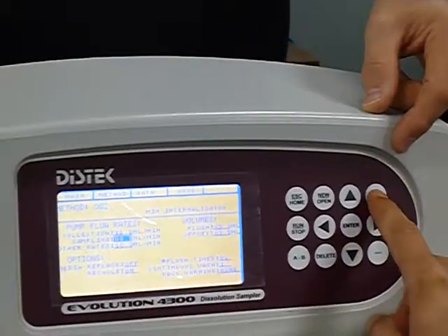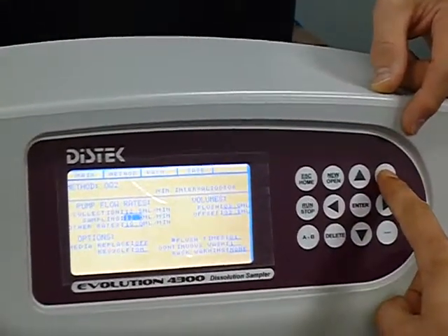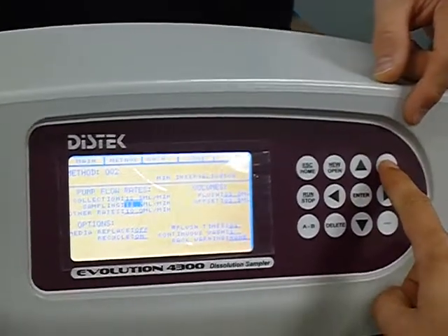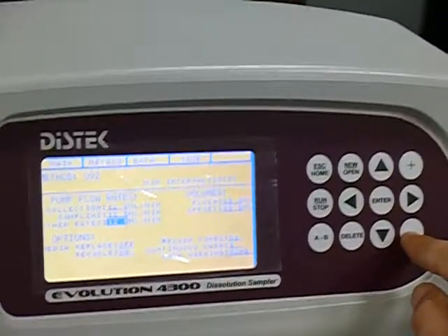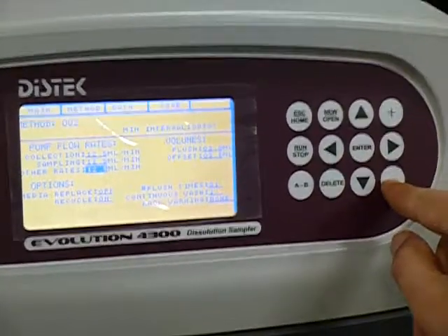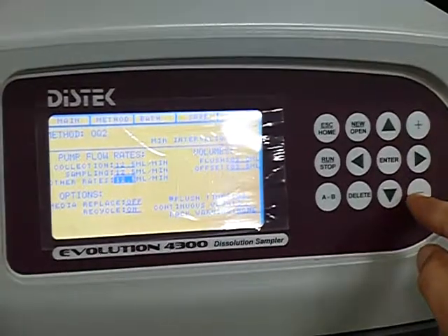That normally will work now for your first OQ1. The older versions, it's probably still in here. Yeah, here.